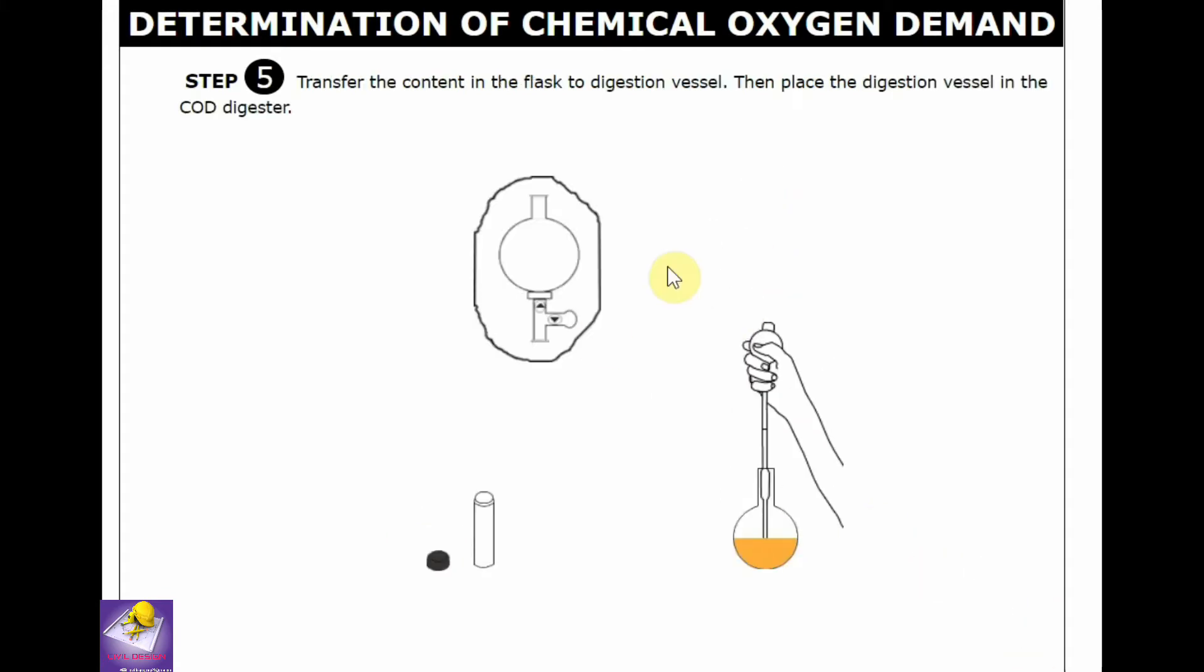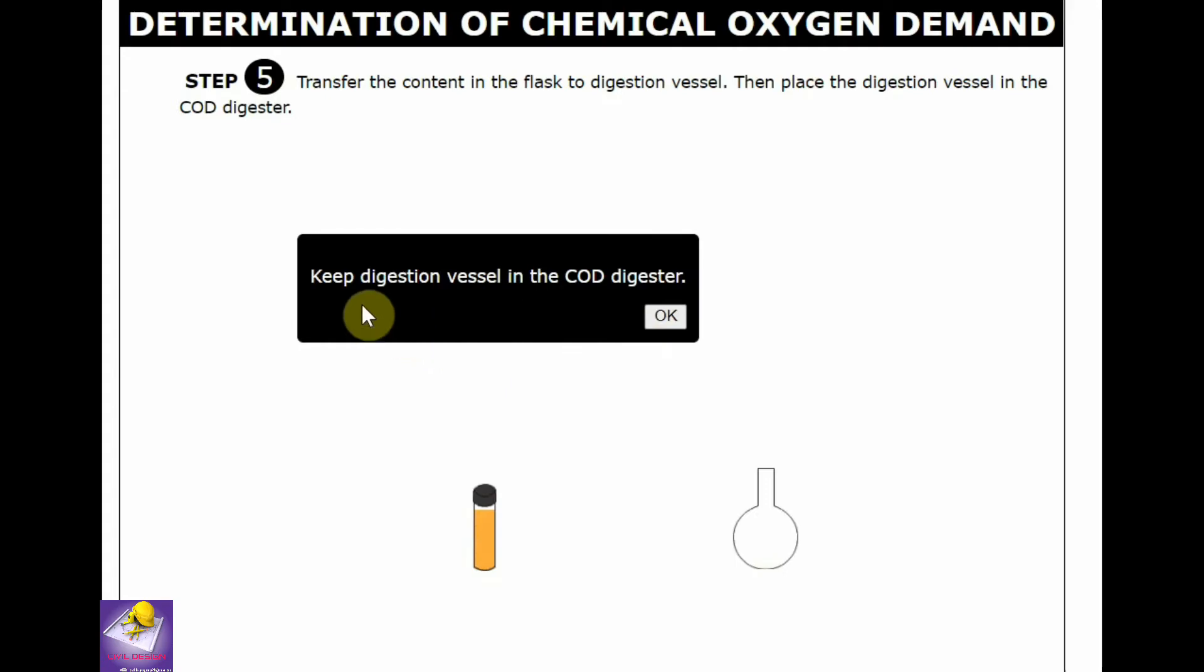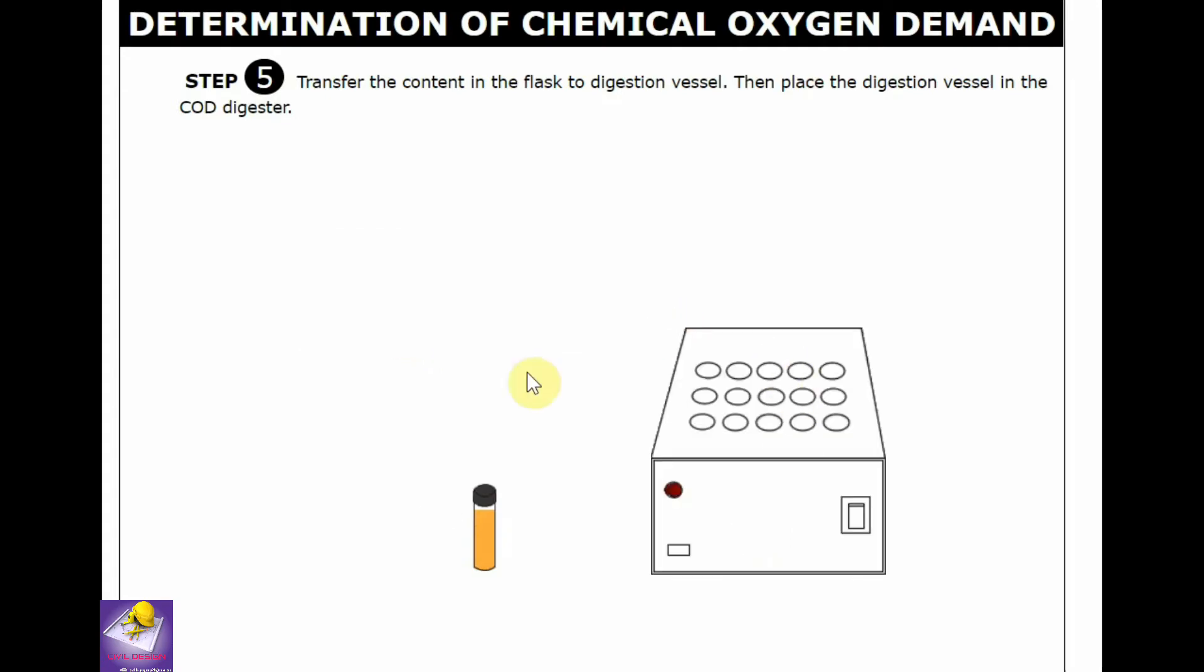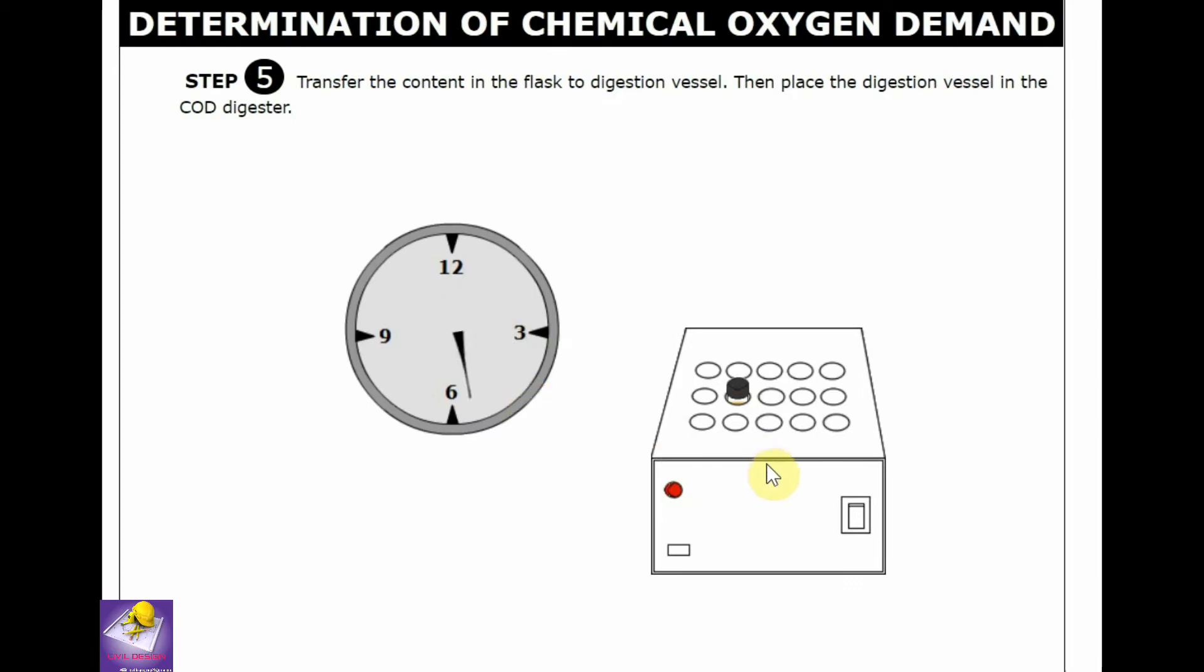Now we have to transfer the total solution to a digestion vessel. Keep the digestion vessel in the COD digester. The digestion vessels are kept in this COD digester and switch it on for two hours. After two hours, switch off the vessels.